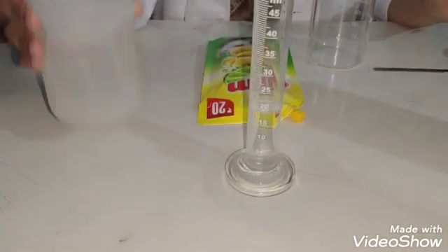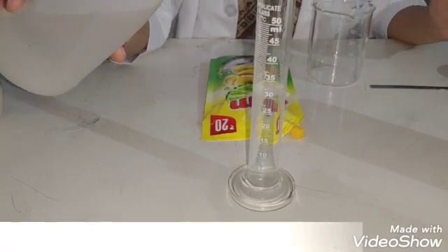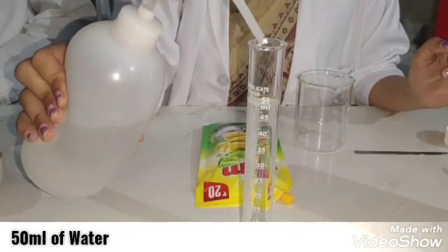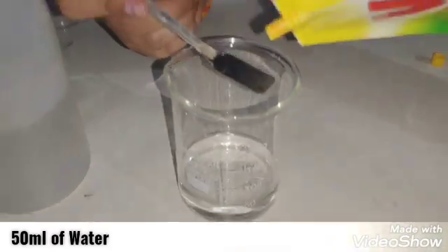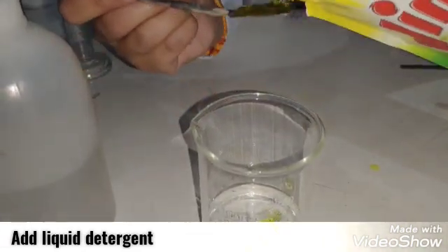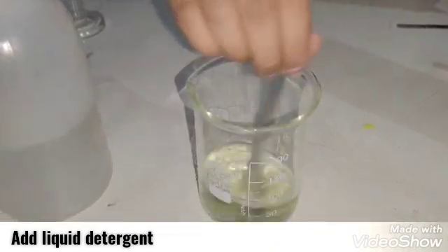In a measuring cylinder, take 50ml of water. Pour it into a beaker and add a small amount of liquid detergent in it. Again, mix it well to prepare a salt and detergent solution.